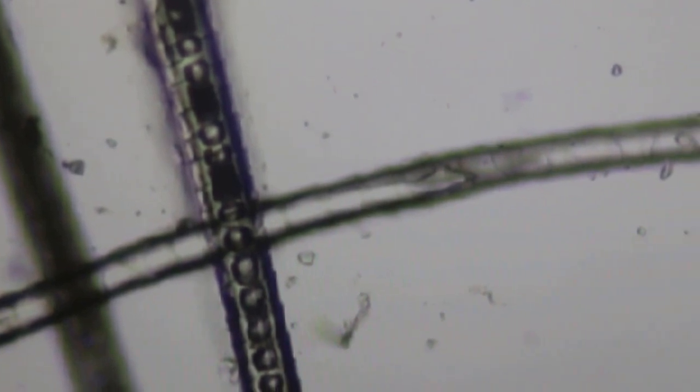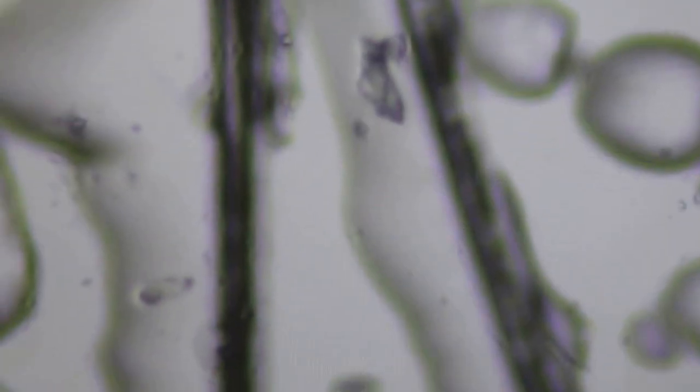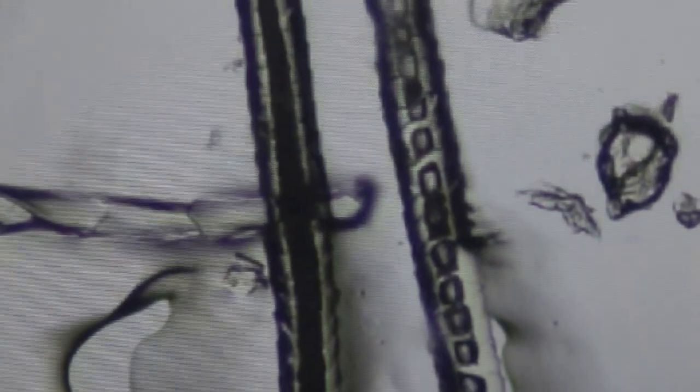You can see the fragmented medulla of the Pomeranian. Is there any outpouching? There's some scratching here, just the breakdown of the cuticle. Normally the cuticle of a normal hair shows no scratching, it's quite smooth. These are the dog hairs. You can see this one is quite smooth. There's no outpouching. But due to the dog scratching there is some roughness in the cuticle.